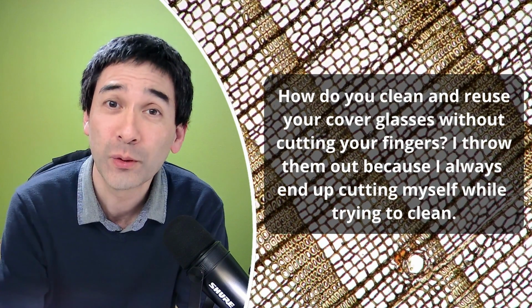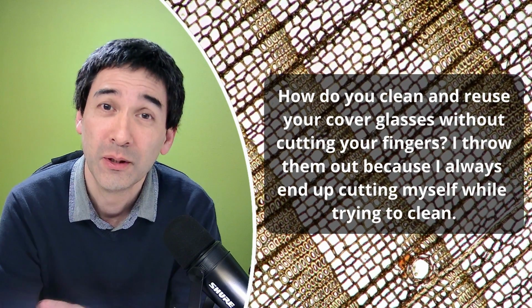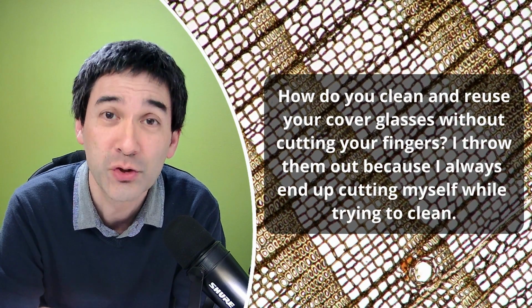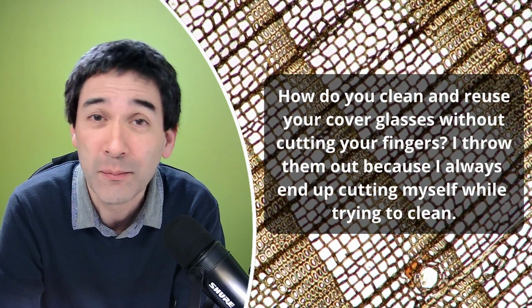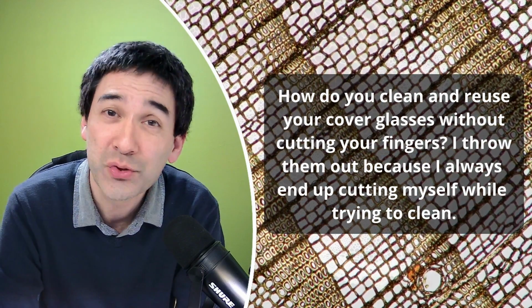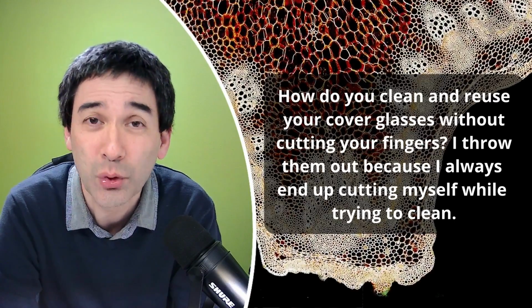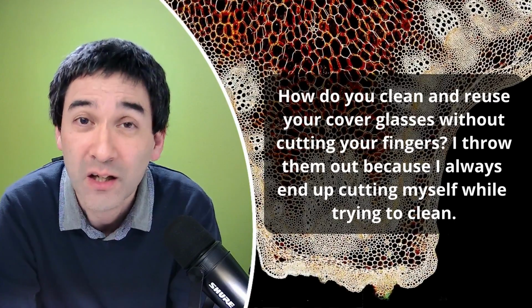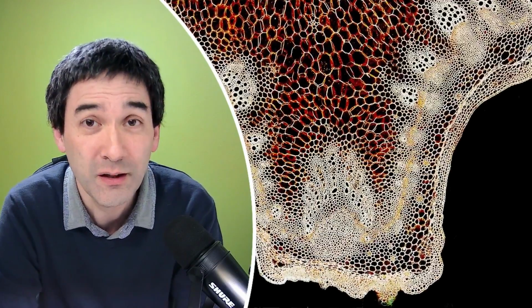Well, first of all, in microscopy, you have those microscope slides. They're made of fairly solid glass. I generally always rinse them in water and clean them, but there are also cover glasses, and those cover glasses are pretty thin. A standard cover glass thickness is approximately 0.15 to 0.17 millimeters. So they're pretty thin, and because the glass is so thin, they're also a little bit flexible.